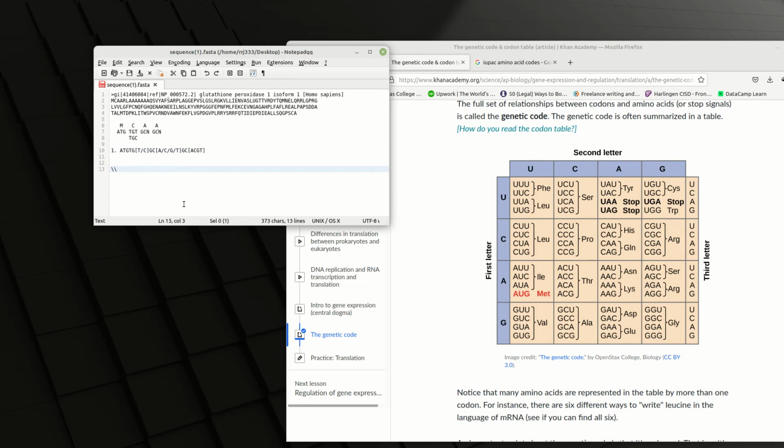I now can, let me do this differently. I have several options. The first one, maybe I shouldn't do this as one, I'll use this as my base.